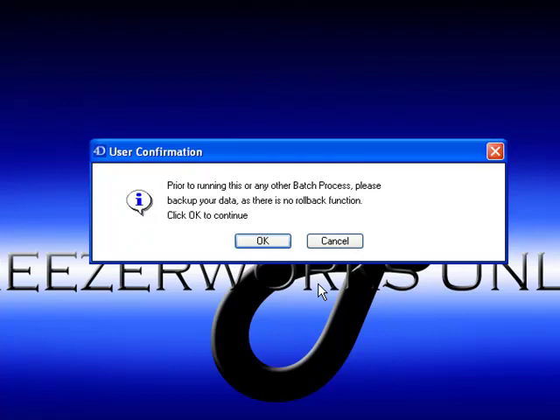In these situations, if you do a batch process and you don't like what you did, it didn't work the way you wanted to, and you want to start over again, you can go ahead and delete those samples and aliquots. But we suggest that for batch processing, it's always a good idea to have a backup.